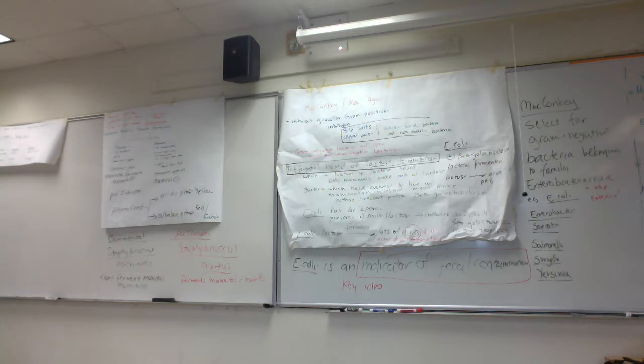And over here, you guys, this is another enteric that can't ferment lactose. So it's tearing apart amino acids. The pH goes up. The neutral red is colorless, right? So there's no pink relative to this side. So we know lactose negative. This could be Salmonella, Shigella, Yersinia. It's not either of those, but anyway, just so you know. And over here, this is our lactose fermenting bacterium. Could be E. coli, yeah.